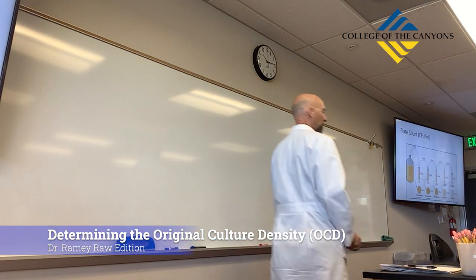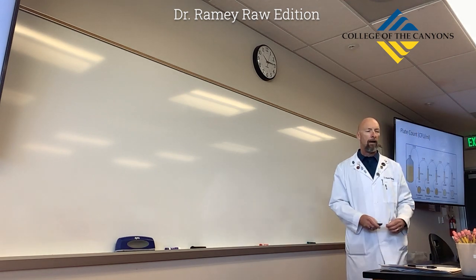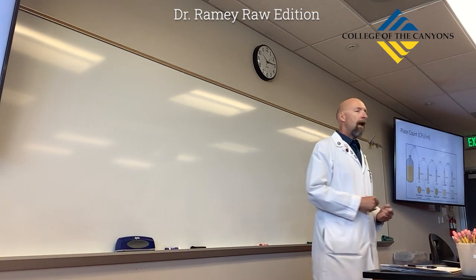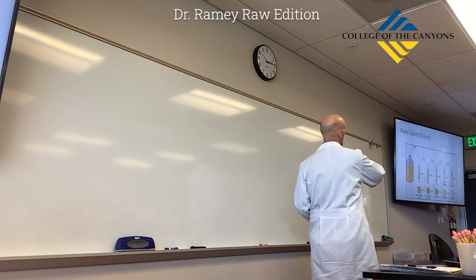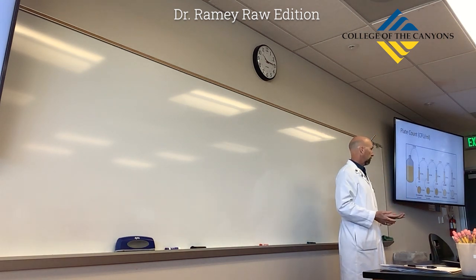Then let's move on to what you're going to do today. Well, I mean, you're going to be doing some culturing, but let's talk about the bacterial population counts, aka the viable plate count. And this diagram kind of is an overview of everything you're going to do.